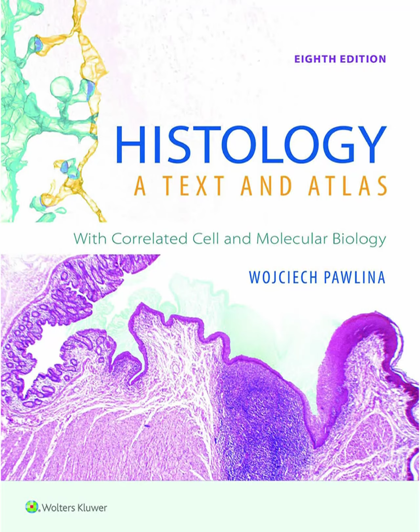And this is usually a chemical process, most often using formalin, which is basically a formaldehyde solution. Its main job is to permanently preserve the tissue, essentially freezing it in time. Freezing it in time, I like that. Why? Well, we do this for a few key reasons. It stops the cells from continuing their metabolism, prevents them from self-digesting, that's called autolysis, kills any microorganisms that might be lurking around, and it hardens the tissue by cross-linking its proteins, makes it easier to handle.